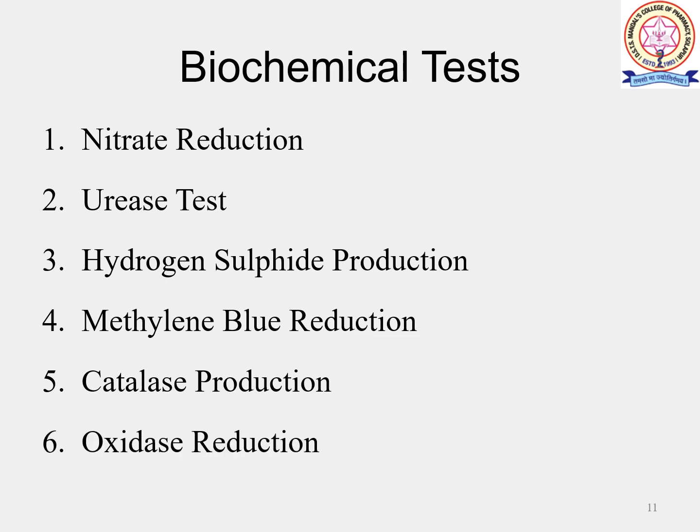Next is the oxidase test or oxidase reaction. This reaction is due to cytochrome oxidase, which catalyzes the oxidation of reduced cytochrome by oxygen. A 1% to 1.5% solution of tetramethyl-p-phenylenediamine hydrochloride is poured over the colonies. Oxidase positive colonies become maroon, purple and black in 30 seconds to 1 minute.